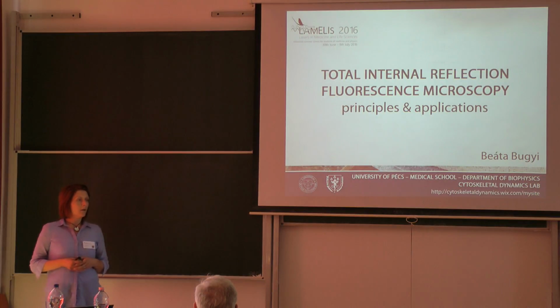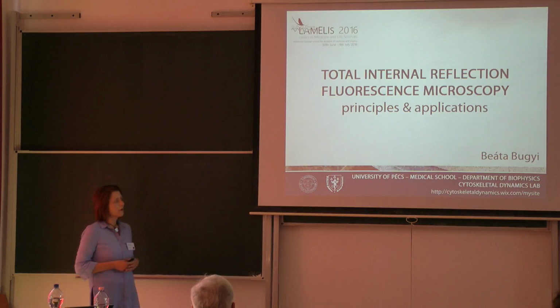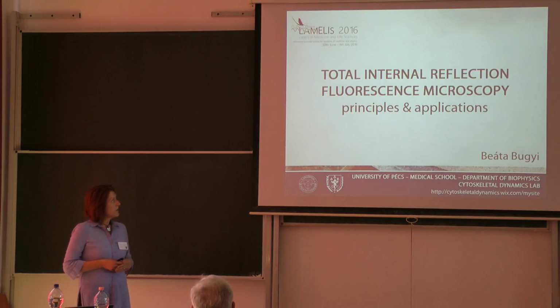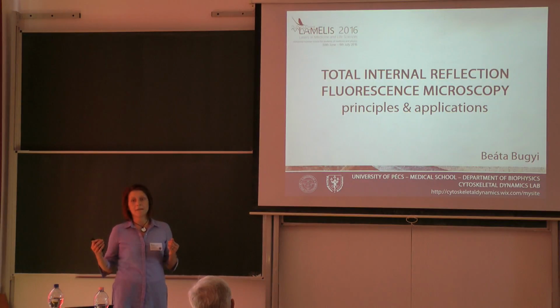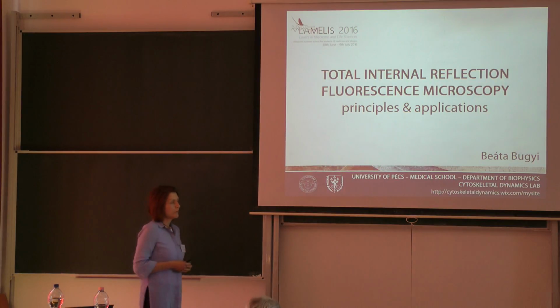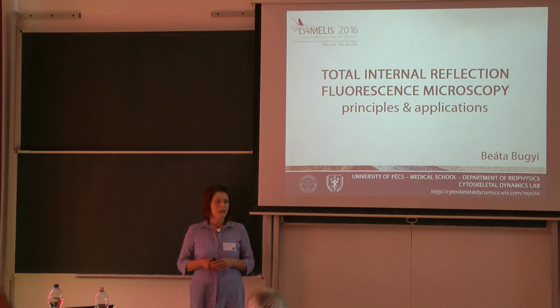We study different processes related to the cytoskeleton, and for that we use TIRF microscopy, which is what my talk is about. Besides this imaging approach, we also have standard confocal microscopy and another super resolution microscope, the structured illumination microscope, the SIM from Zeiss.